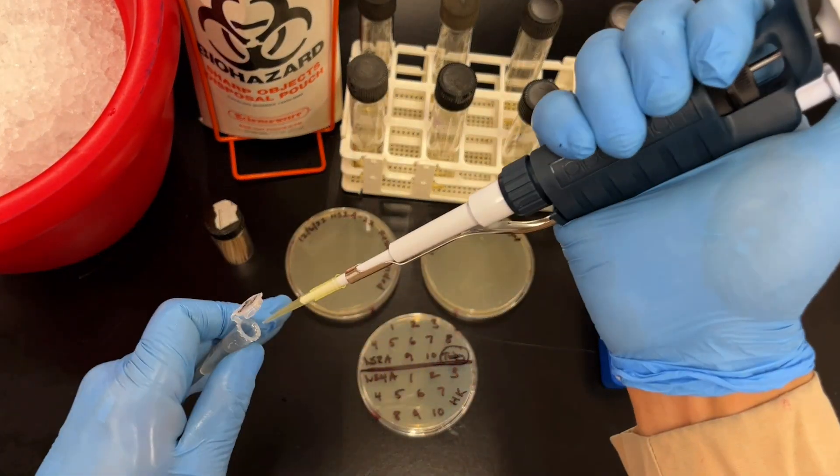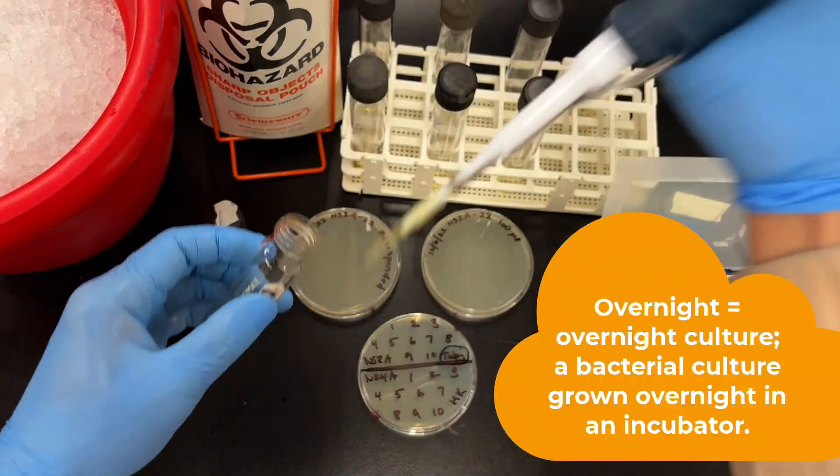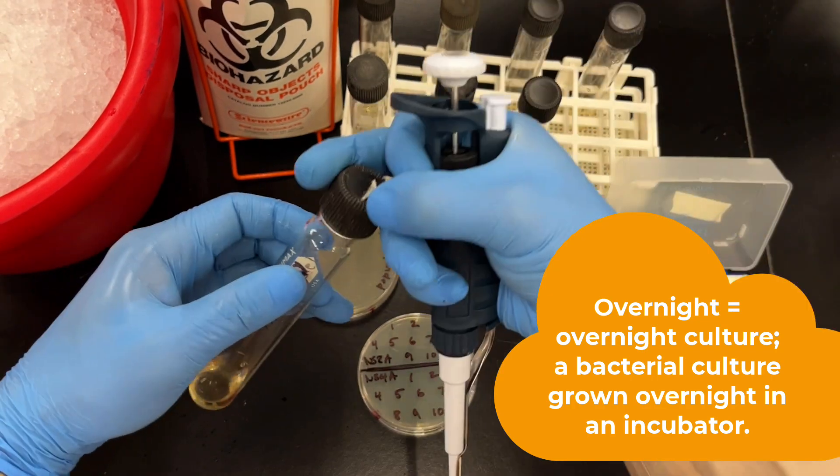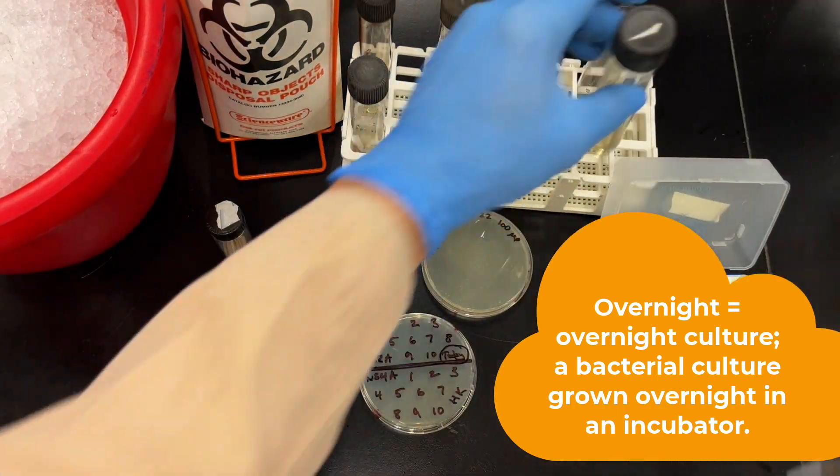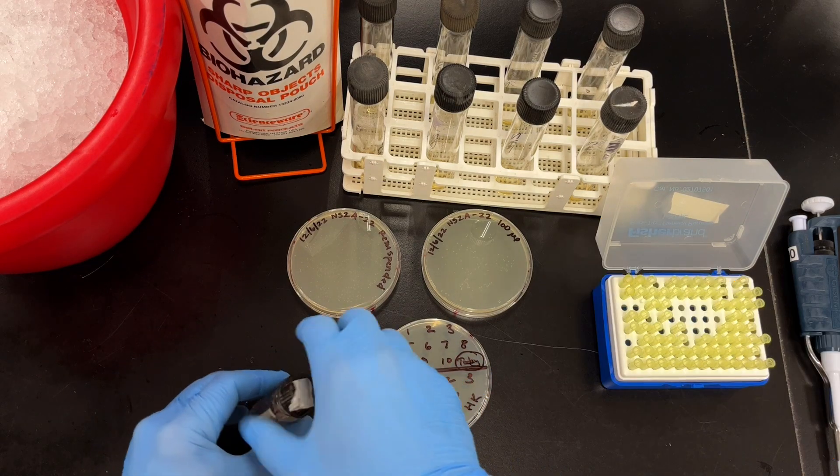Now, sometimes all you're going to do is pick clones. But other times, you're also going to want to start an overnight for a plasmid prep the next day. So I have a bunch of tubes all pre-labeled. Add the appropriate amount of antibiotic to each tube, and we're good to go. So I already added in the seven others.